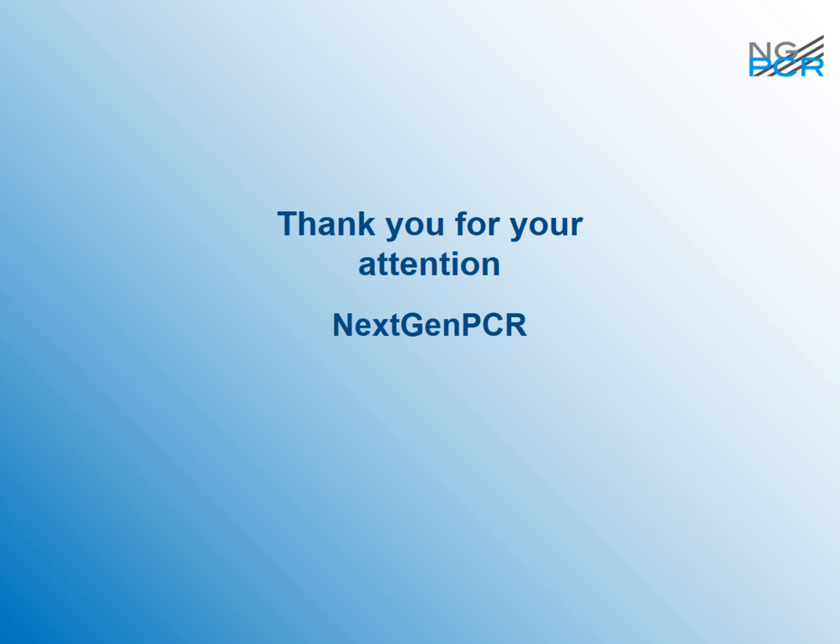Has any work been done for multiplex PCR? Yes, of course. Many of the forensics kits, for example, work with 12-plex or 24-plex. Some of the older kits, which try to use the fact that normal PCR machines can do very slow ramping, take much more optimizing, but the modern kits should normally work. Yeah, it takes a little bit of optimizing, but not too much.